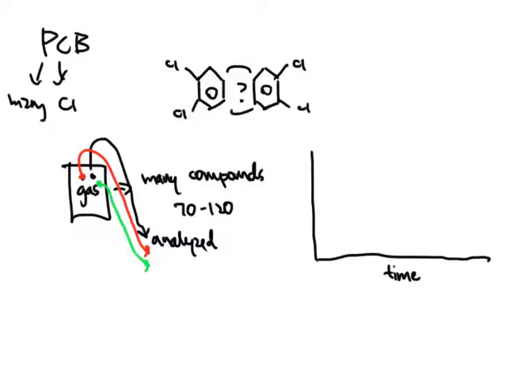Now these can come in minutes or these can come in seconds. It can be any unit of time that it wants, but typically these are reported in terms of minutes because that's typically the run time. These are minute run times. They're not second run times, and they're not hour run times. These are in terms of minutes. So that's the number that goes onto the bottom.